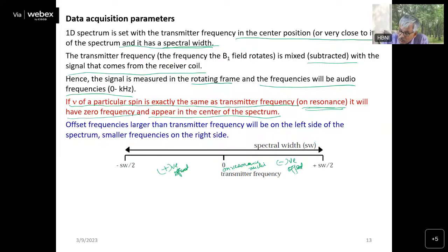But when you put your TMS here, TMS is 0 with respect to your referencing, but while you are recording, suppose it is placed at 5 ppm, it will no longer be 0 with respect to the transmitter; it will have some frequency. So don't get confused by that.